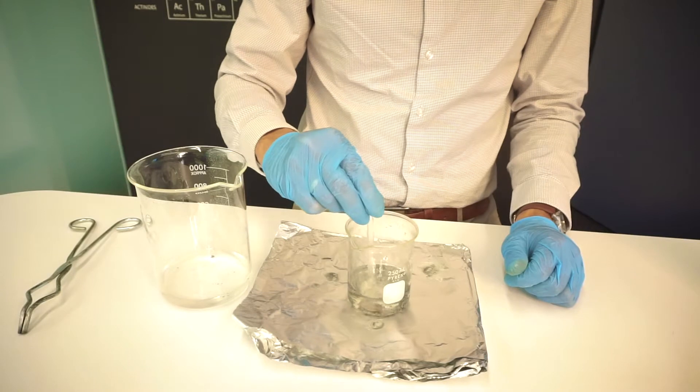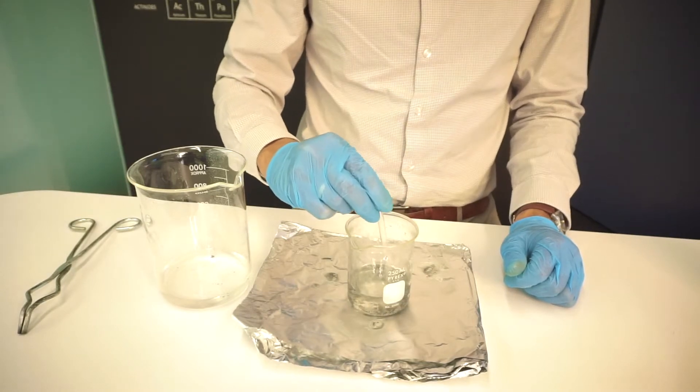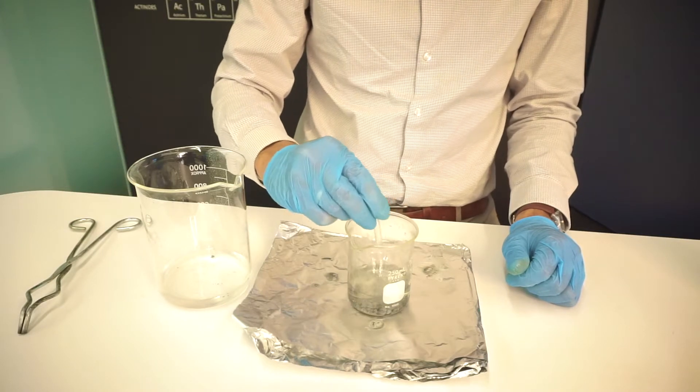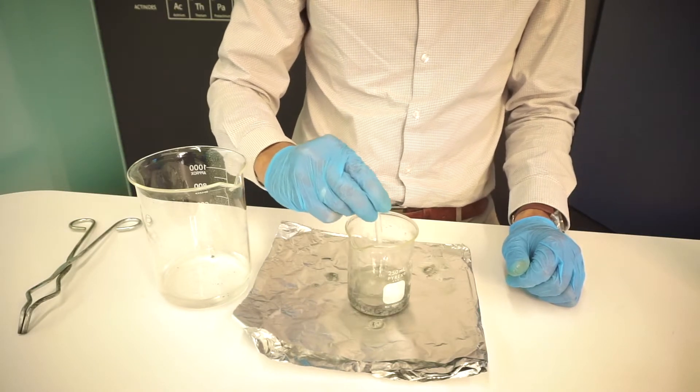We made this solution of sodium zincate using water and sodium hydroxide, which is a strong base, and zinc metal. That's the gray stuff you see floating around here.